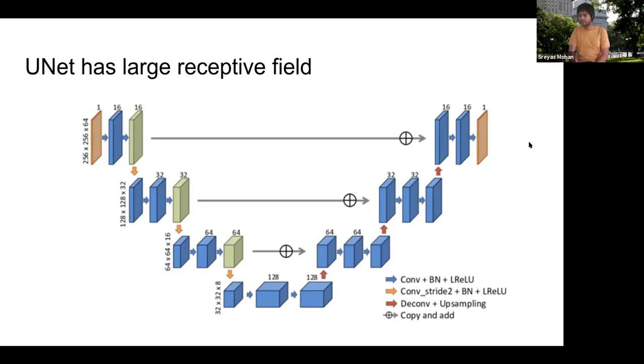This sounds like a good solution, but did you just not include more layers of the neural network because that gets more computationally expensive? That's an excellent question, Shreyas. As you saw over there, we used about 20 layers to get a field of view of 41x41, and that's about 600,000 parameters. We were effectively aiming for, at the end, the best method that worked had a receptive field of more than 300x300. If you had to just stack on layers and get that much receptive field, it would be a giant network. And unfortunately, NYU doesn't provide enough computation to train anything like that.